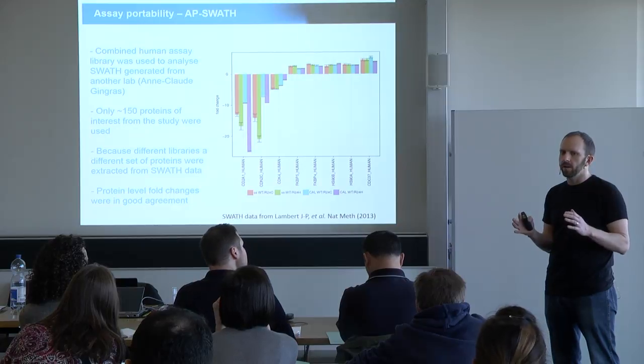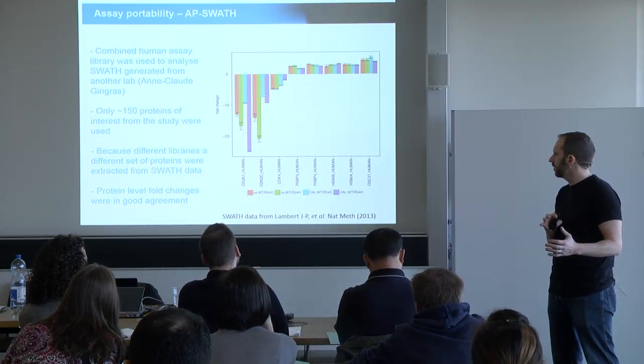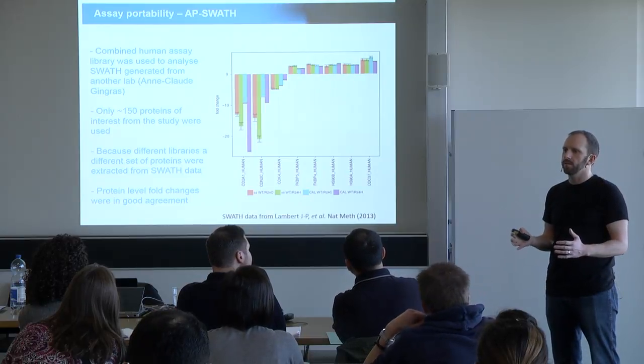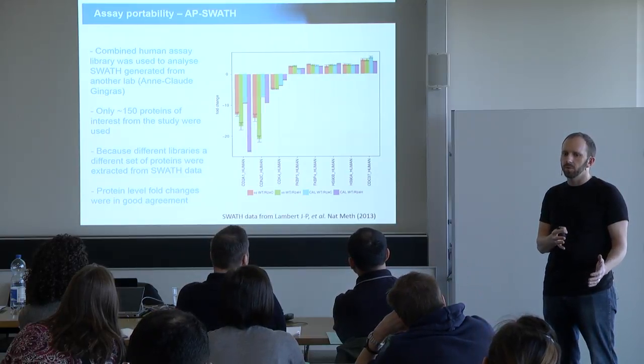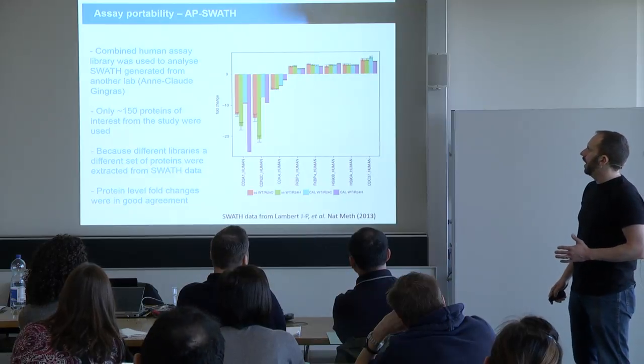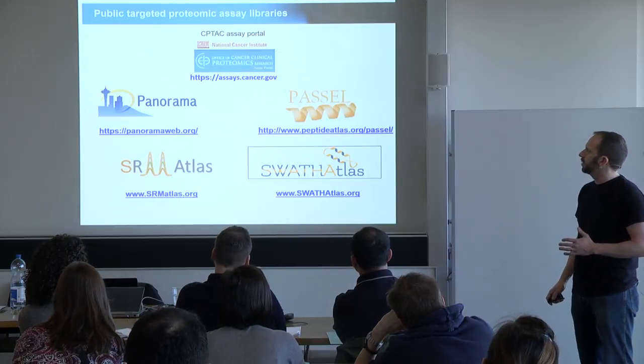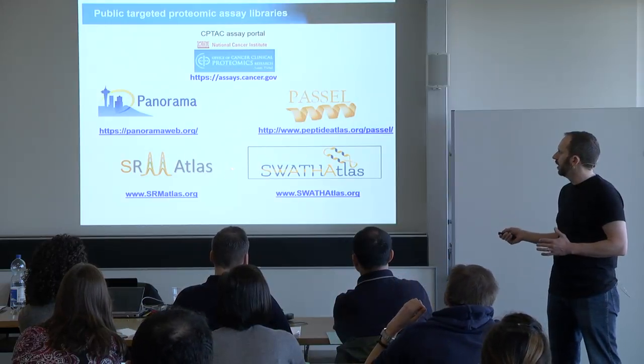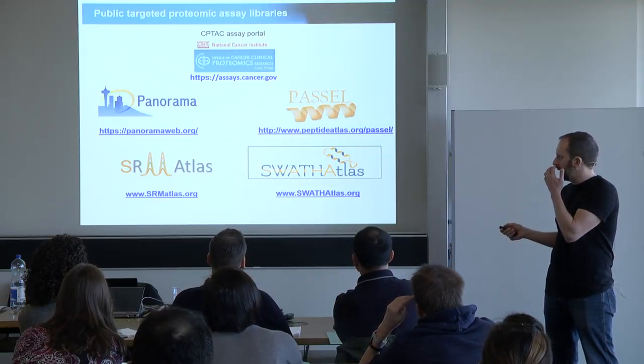She had higher coverage because she had these affinity purification samples. But essentially, our conclusion from this was that it basically works. The biological conclusions of the experiment were consistent. And so we now have a number of publicly available assay resources.